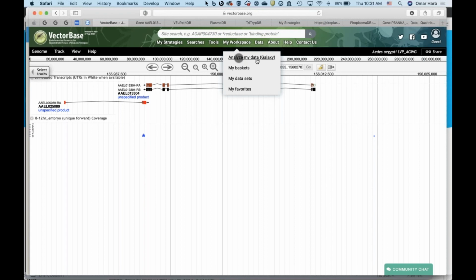So my recommendation, if you are interested in really trying to extract SNPs from RNA sequence data, is to go through the trouble of reanalyzing the data, because there will be tools that allow you, based on the alignment, to determine SNPs and define some of the robustness of the SNPs. Because if you have one read that has a nucleotide change, how much are you going to trust that, right? So you want to be able to do something a bit more statistically robust.